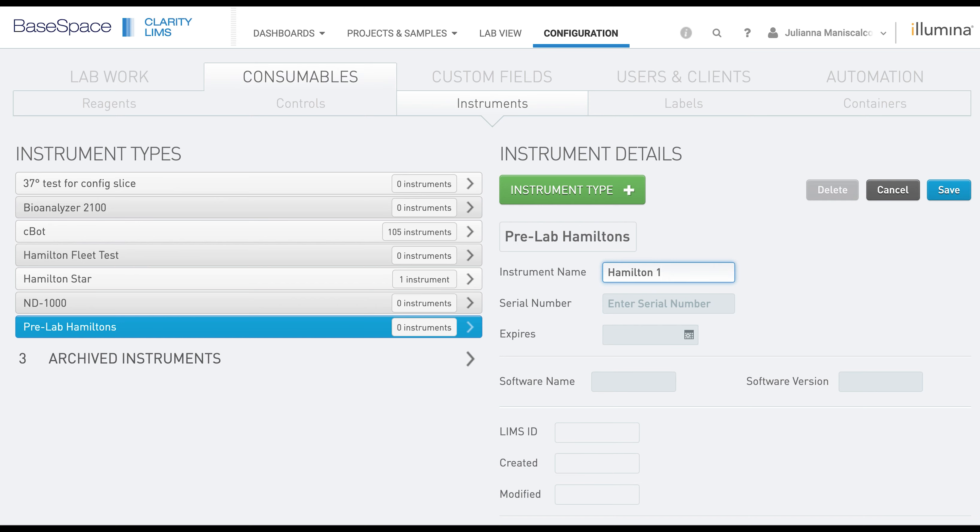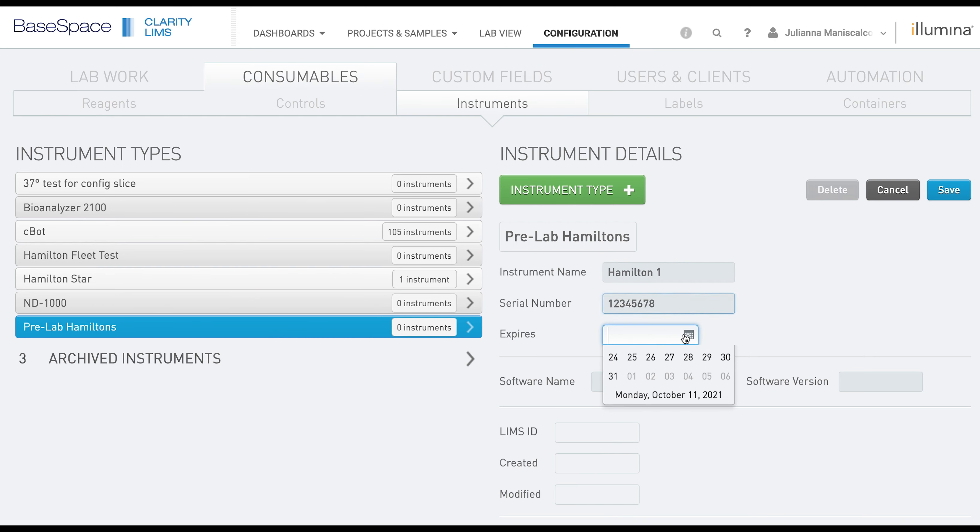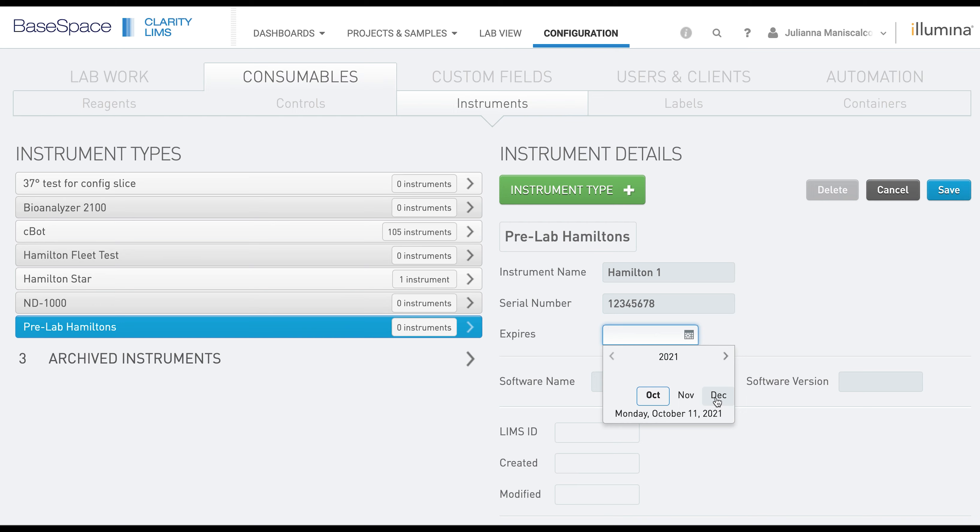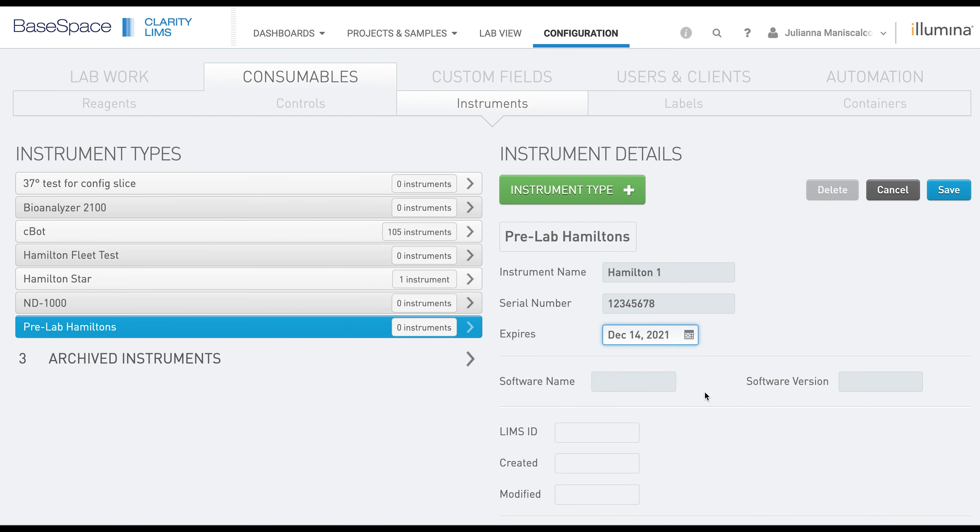The only mandatory field here is instrument name. However, you also have the option to add a serial number, an expiration date, software name, and version. Then you can click Save.